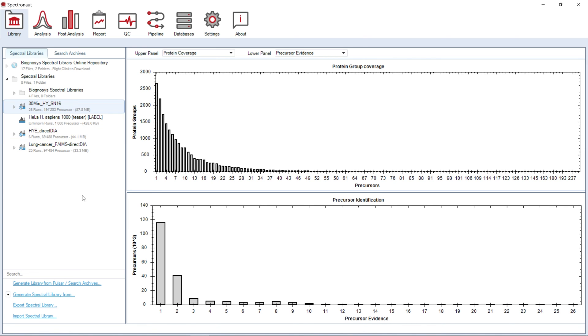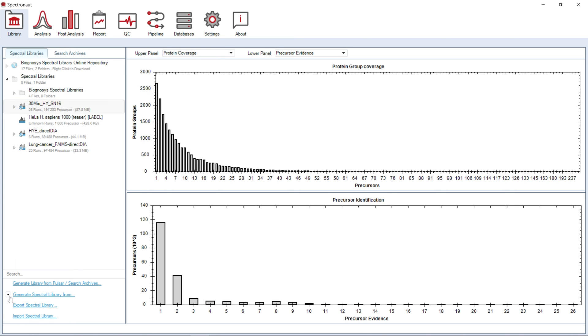Alternatively, you can generate a library from the results of other search engines, or you can import a ready-to-use library using an option below.